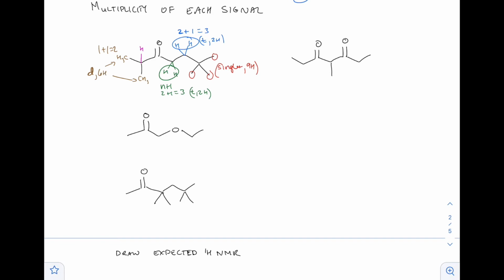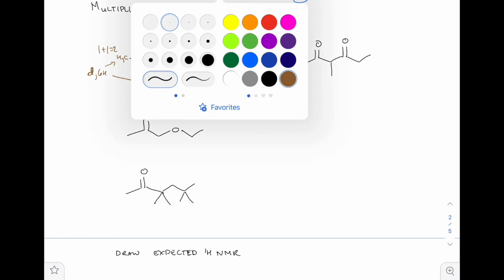They have the same chemical shift, because if you rotate about this chemical bond right here, you can't tell what the difference is. There's a little complexity to it, but I'll leave it alone for now. Let's just call it doublet, 6 protons.